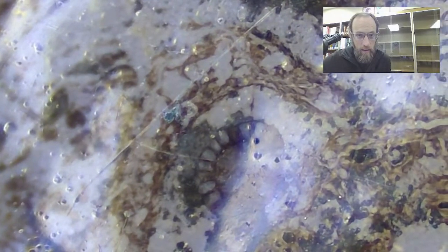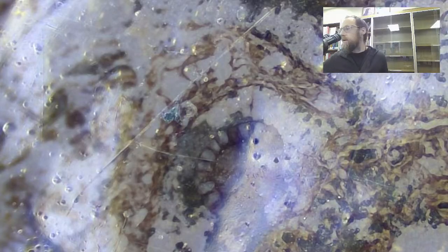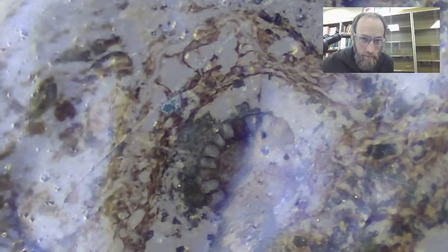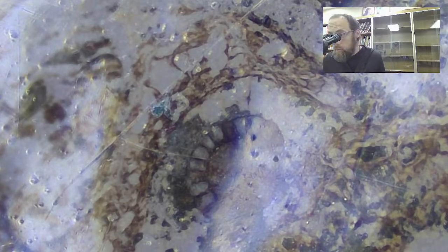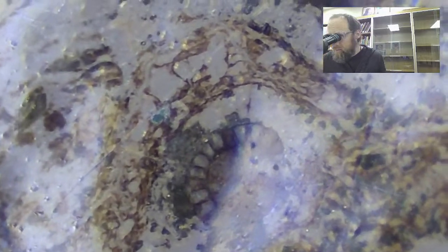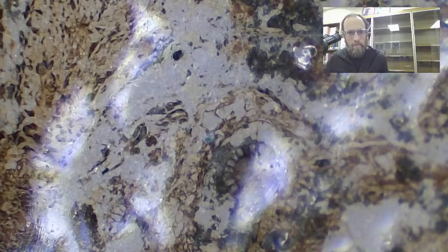In fact, given its small size, well, I've been tempted to call it something like a, it's not a foraminiferan. Yeah, I just don't know. It's not a bird's head, even if it looks like one. Not a bird eyeball. I can tell you that much.